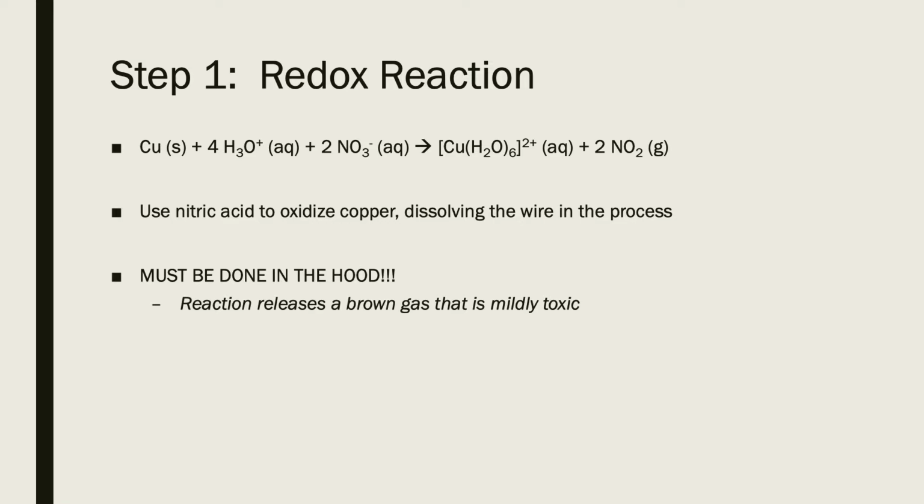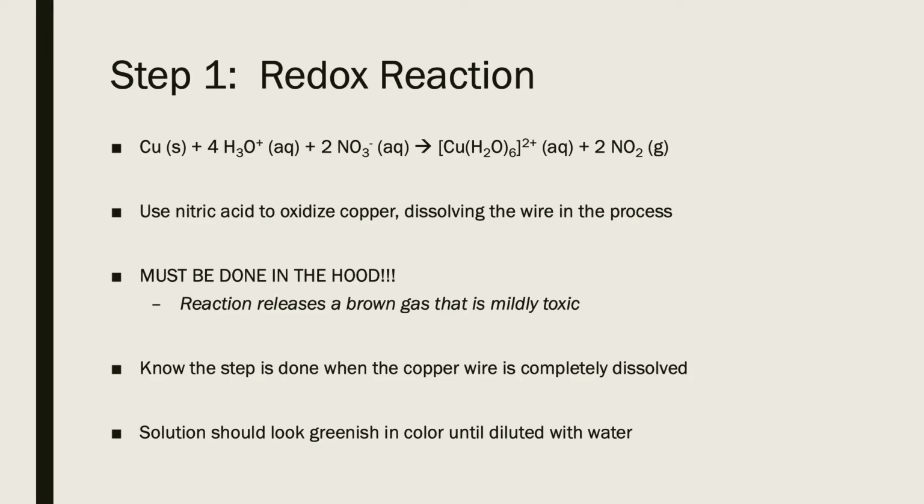So until the copper wire is dissolved, we want to leave this reaction in the hood, and that's really how we know the reaction for this first step is done. We're just waiting for that copper wire to be entirely dissolved. Color-wise, visually, when that wire is dissolved, we should see our solution turn a dark green color.